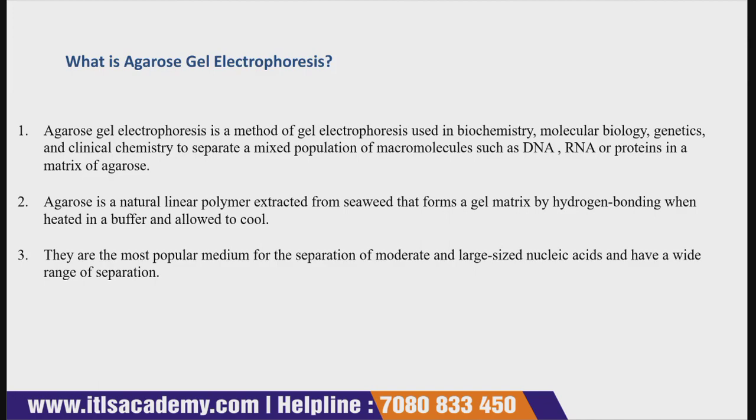They are the most popular medium for the separation of moderate and large sized nucleic acids and have a very wide range of separation. So one of the most popular media is agarose, and this medium is generally used for the separation of moderate or large sized nucleic acids and has a wide range of separation. In simple words, you can say they separate a mixed population of macromolecules like DNA, RNA, protein, nucleic acid, right? And it is a natural linear polymer.